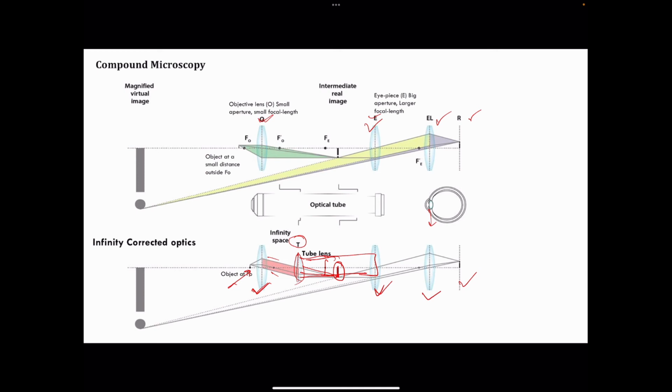Since a microscope is not used just to magnify the object, it is also equally important to visualize the object with utmost clarity. And now when we see different kinds of microscopy and contrast enhancement methods in light microscopy, we will see what different kinds of optical elements are actually required to be introduced for doing this specialized contrast enhancement in your light microscopy setups.